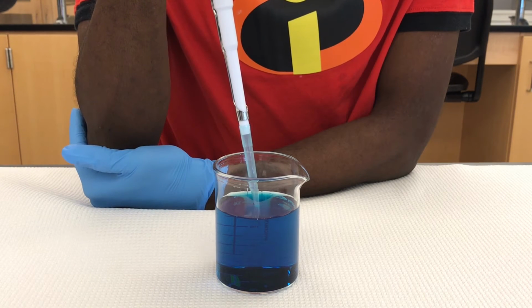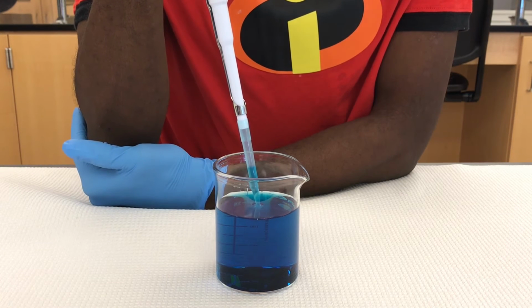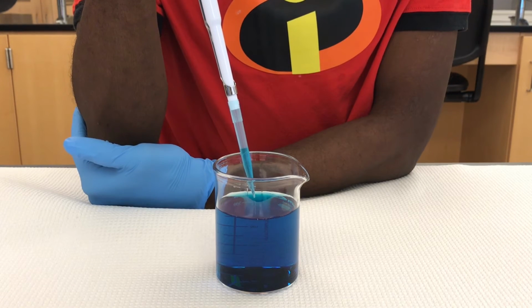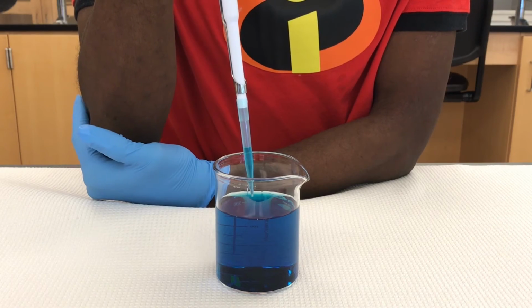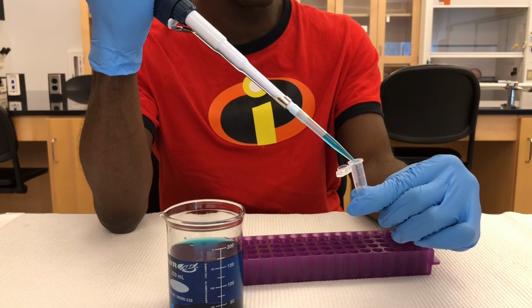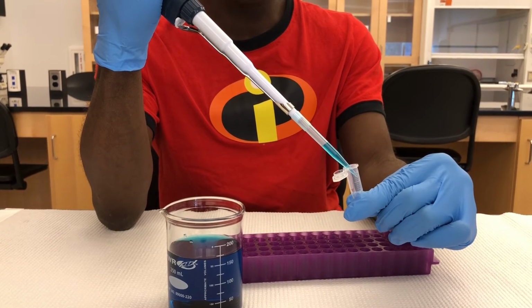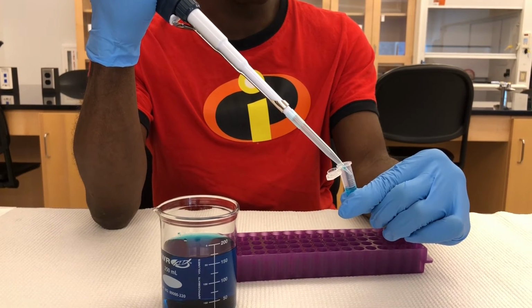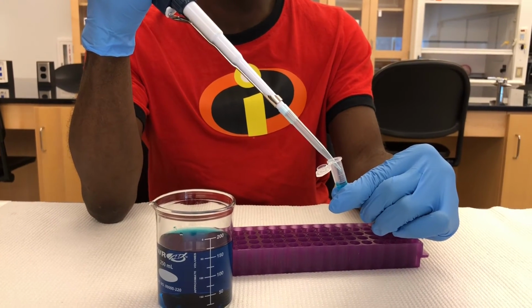Slowly and carefully release the plunger to draw the liquid up. Wait for 1 extra second before removing the tip. After removing the tip from liquid, keep the micropipette in a vertical position with the tip pointed down. To expel the liquid, place the pipette tip at an angle of 10 to 45 degrees against the wall of a receiving vessel. Depress the plunger to the first stop point. Wait 1 second and then depress the plunger to the second stop point to remove any remaining liquid in the tip. Without releasing the plunger, remove the tip by sliding it up the wall.